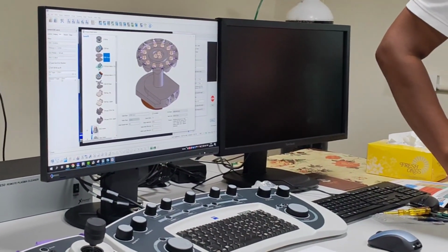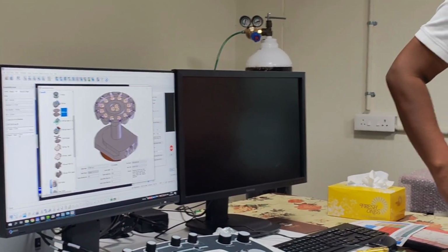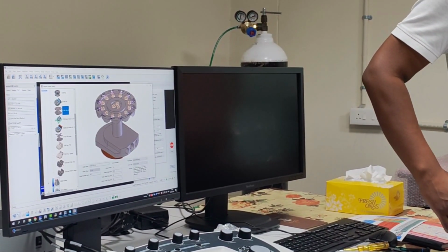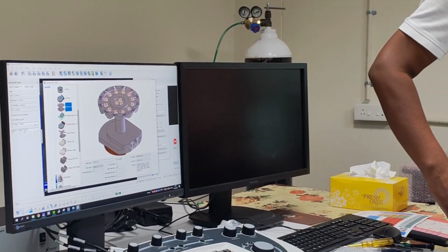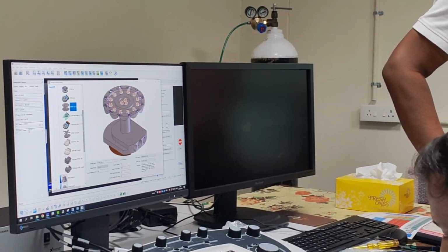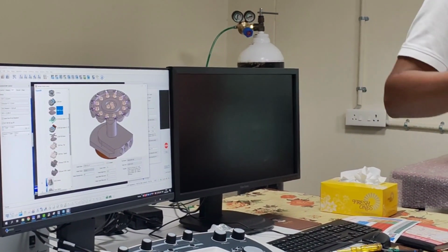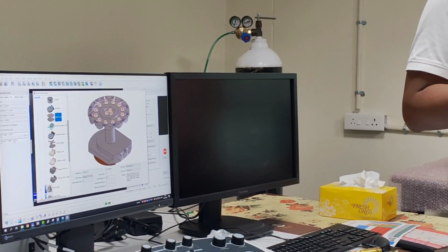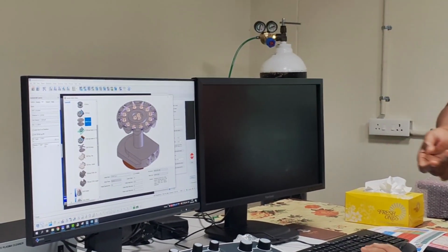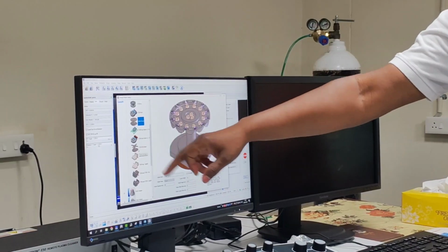Sir, what about powder samples? Powder samples, if you have nano powders, you have to do it on a drop caster. First disperse those in a buffer where the particle properties won't change, and then drop cast on a TEM grid, where carbon supported TEM grids will be there.